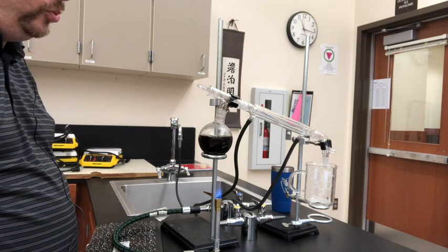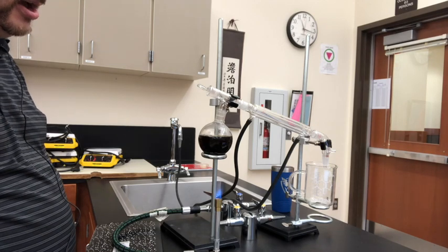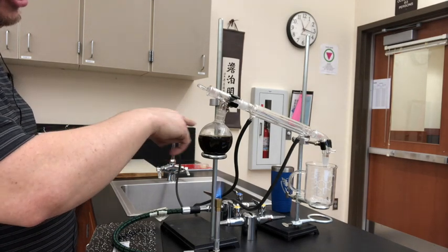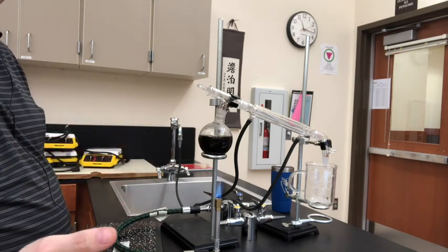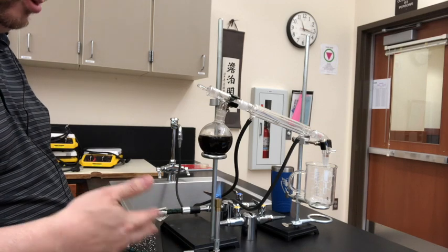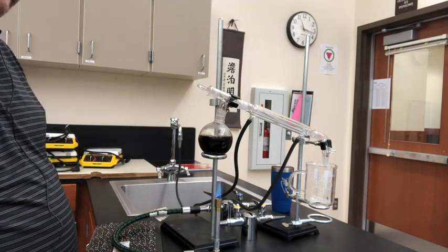Now, remember I said I didn't want to get the heat up too far or too fast. Because if this thing starts boiling and doing its thing, you'll actually get coffee up into the condenser and you won't get clean, clear water out at the other end. And what I want is clean, clear water. So that means this is going to take a while.